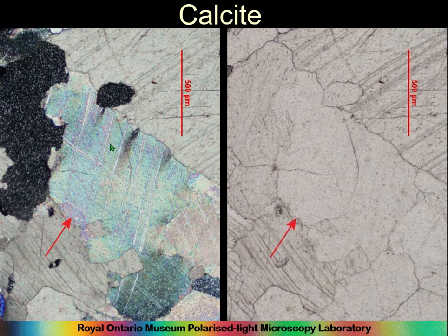It's very pastel, so pastel it's almost white light, whereas this practically is white light. However, it's not. It's actually very high order birefringence. And there is a way of distinguishing the two, which we'll be showing you in the first lab.